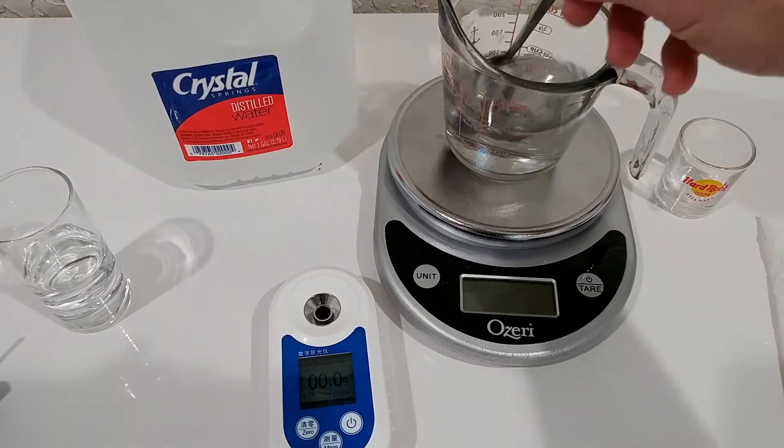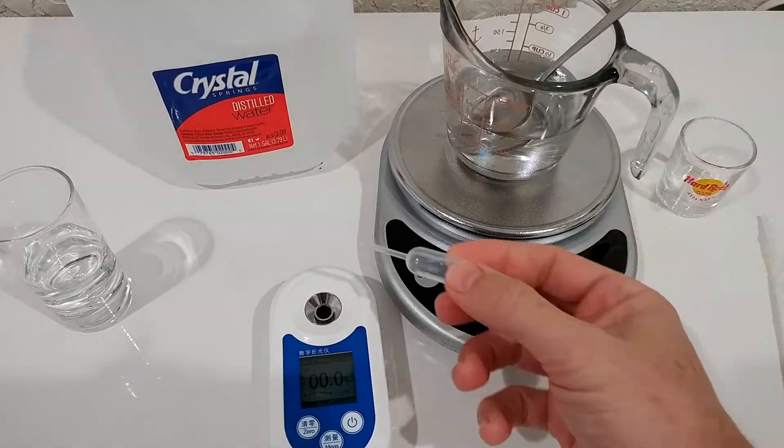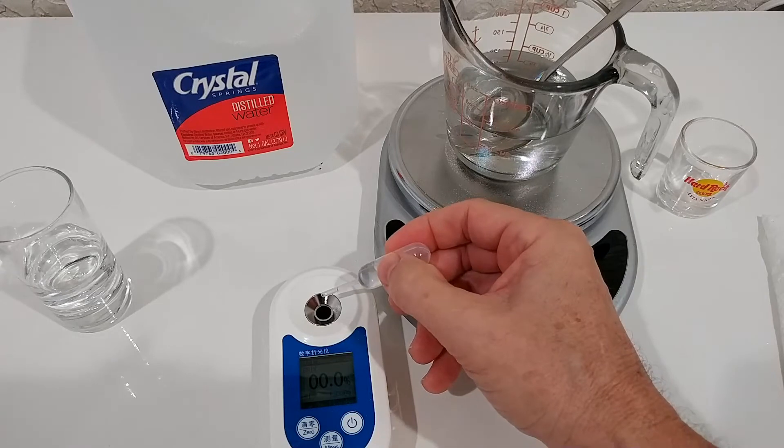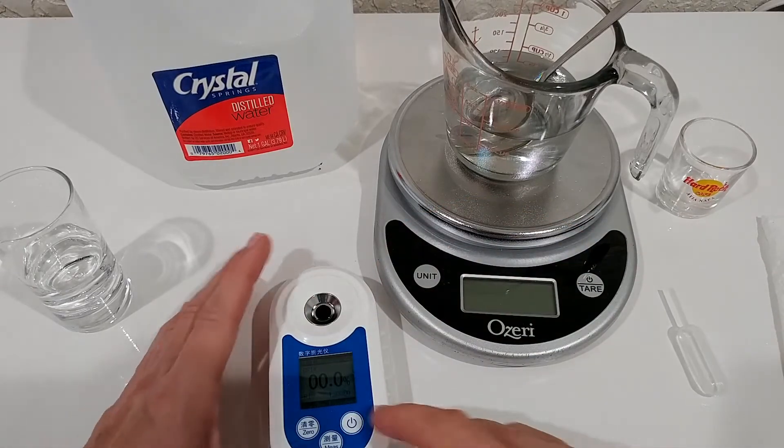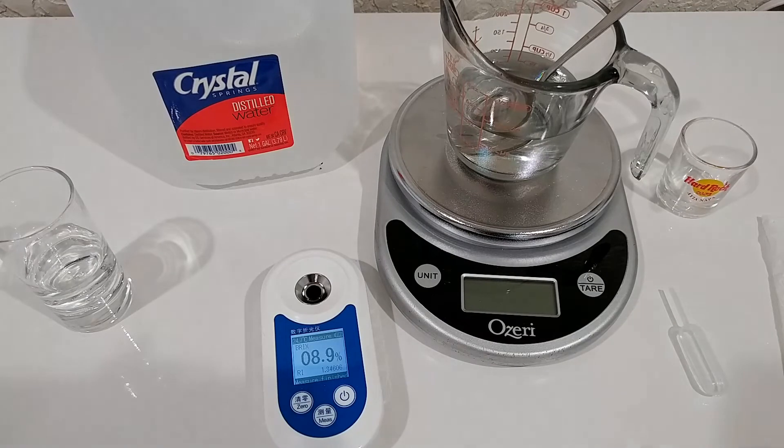I'll give it a final stir. It looks pretty nicely dissolved, so let's try with six drops. And now let's start the measurement. It comes up with 8.9% — absolutely amazing.